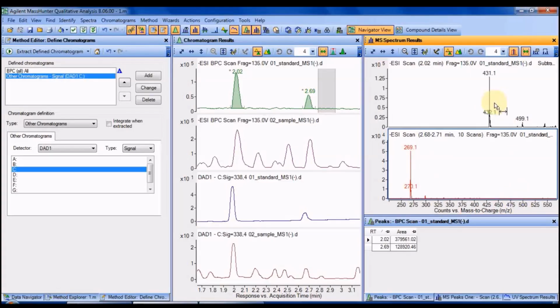We can see that both compounds give almost exclusively deprotonated ions, and generally in negative mode fewer adducts are observed, as well as fewer fragments, which contributes to better sensitivity. Additionally, both compounds are phenols, and thus they are acidic, and they give stronger signal in negative mode than in positive, which together with lower and cleaner baseline allows for much more sensitive analysis.